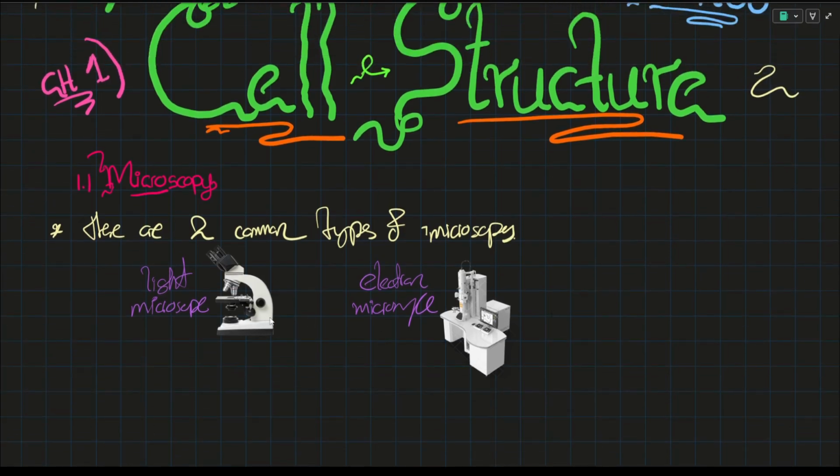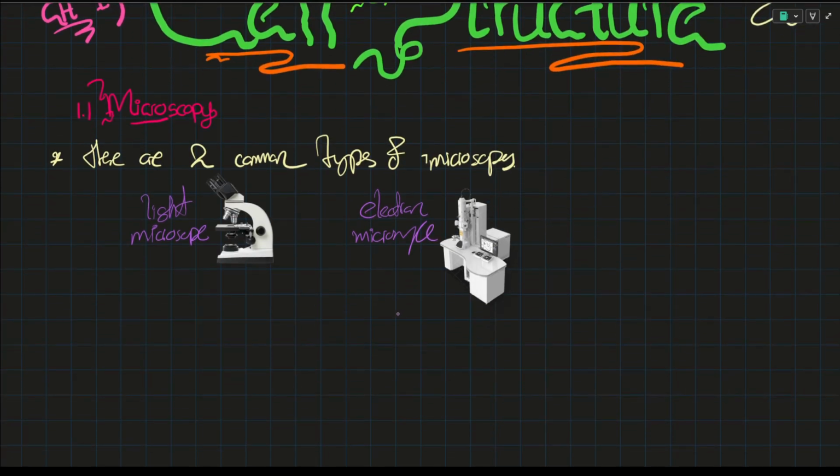When it comes to the light microscope, it's pretty straightforward. We have one type, we have this type and this type only. But when it comes to the electron microscope, I can actually give you two variants of it. When it comes to the world of electron microscopes, we have a transmission and scanning form difference. Okay, that's too much. Let me clarify.